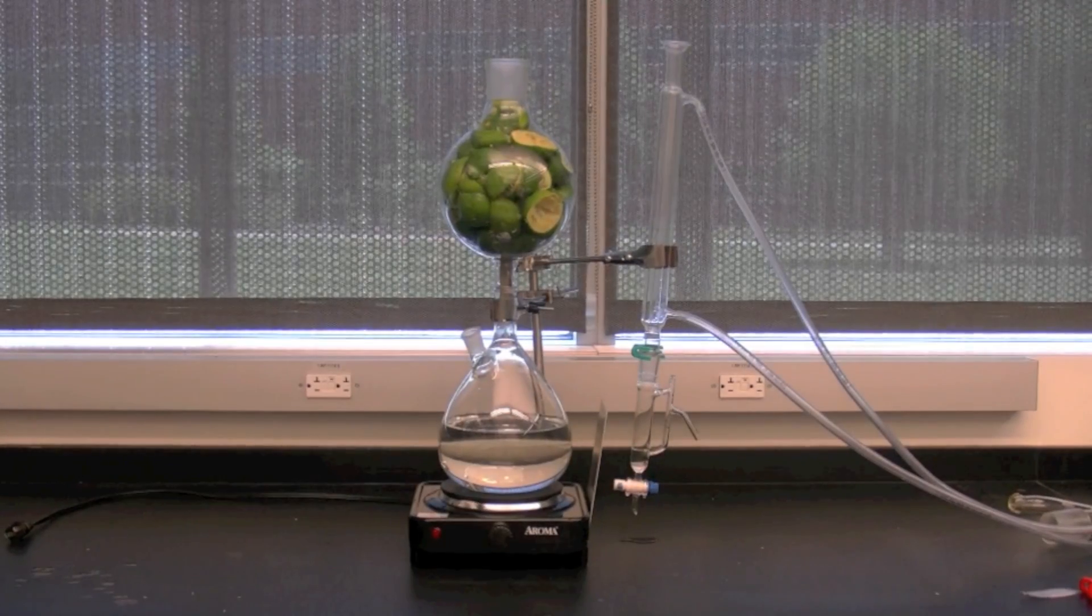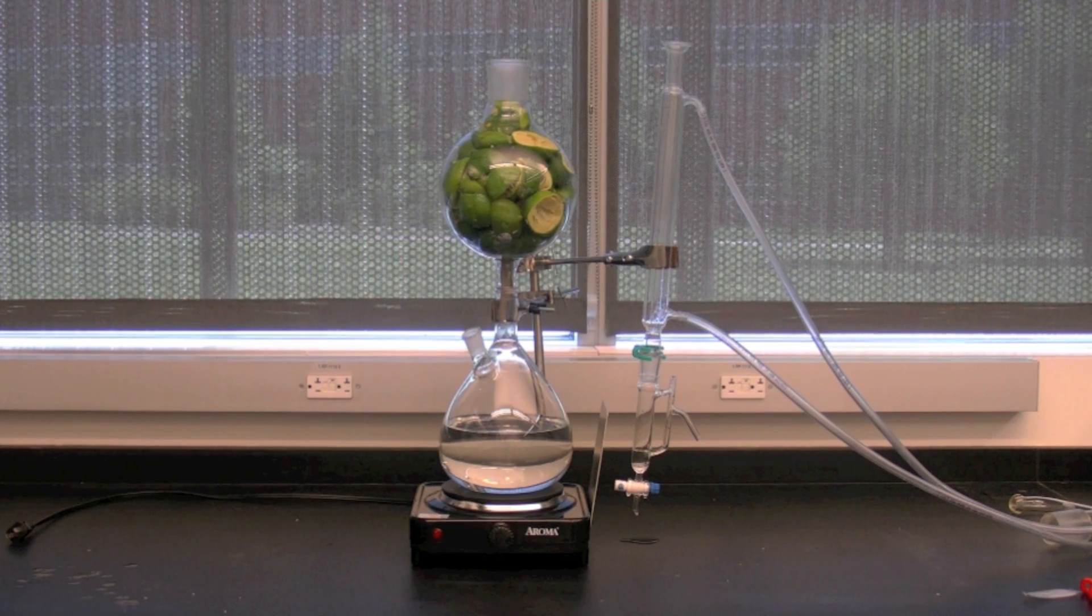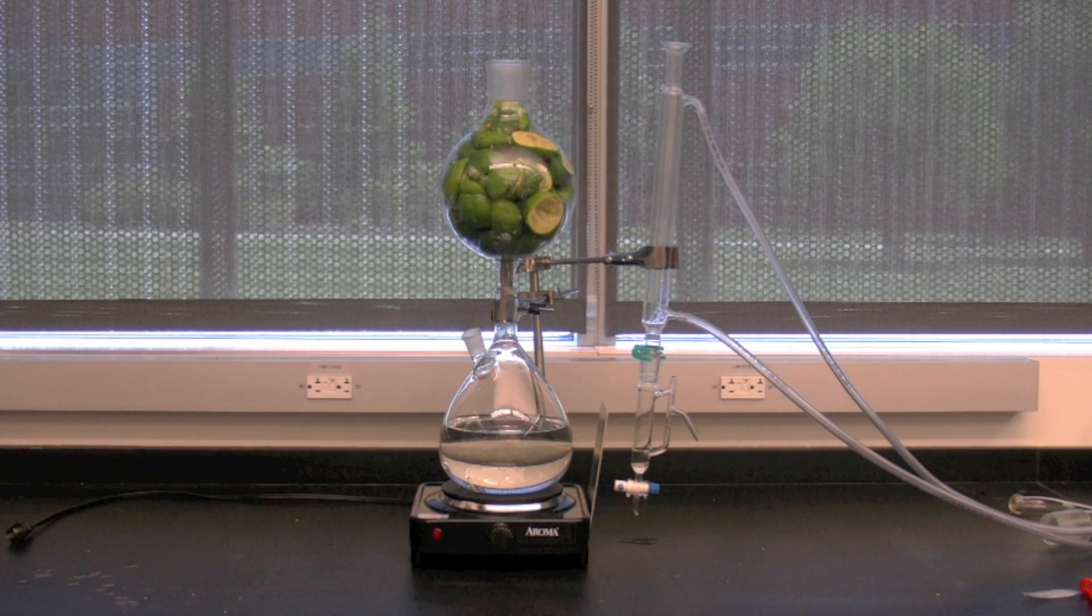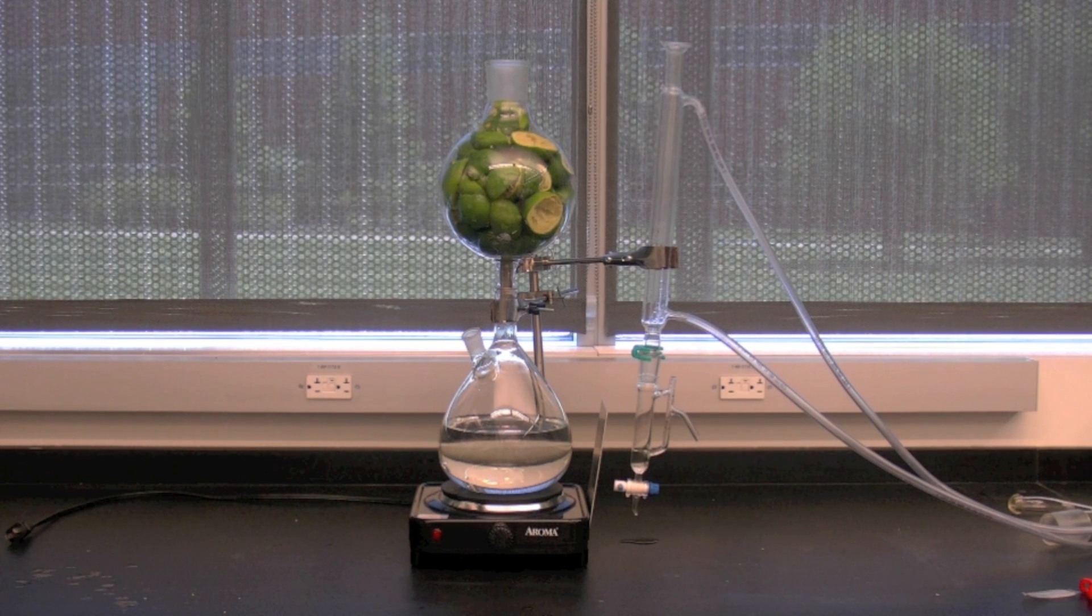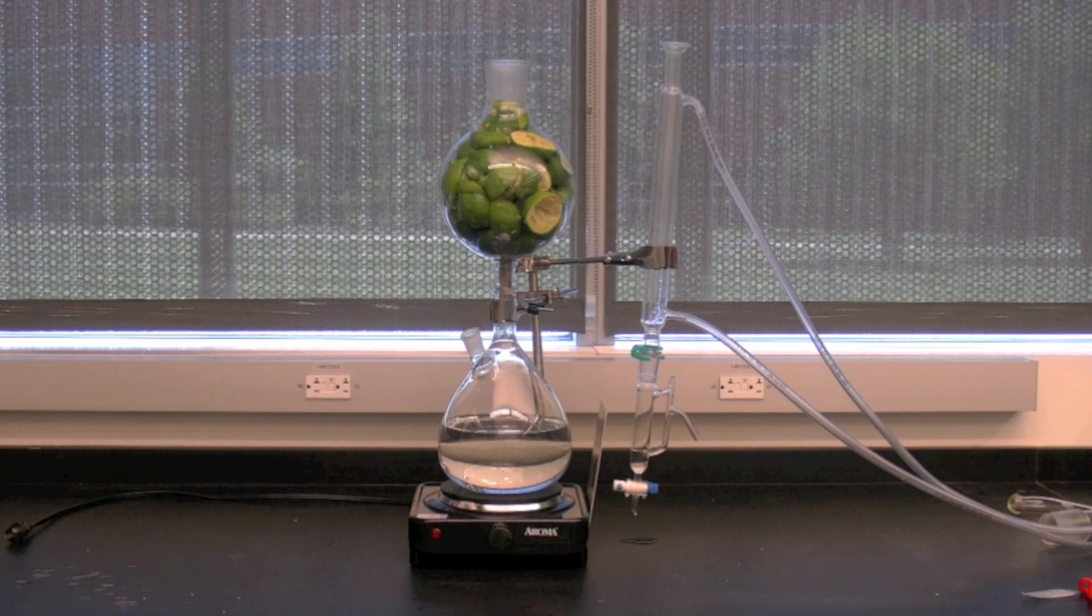This all-glass vertical steam distillation unit is used for dry steam distillation of plant material. The steam distillation of biomass generally yields two products: a relatively pure essential oil and an aqueous condensate called a hydrosol.